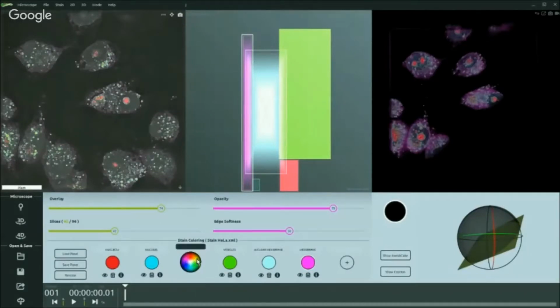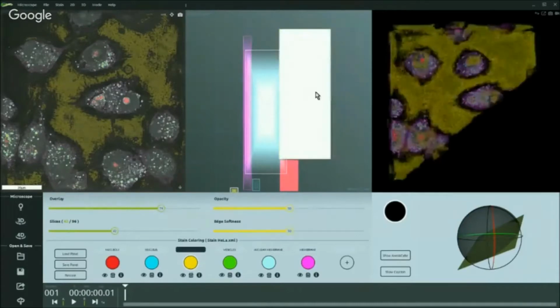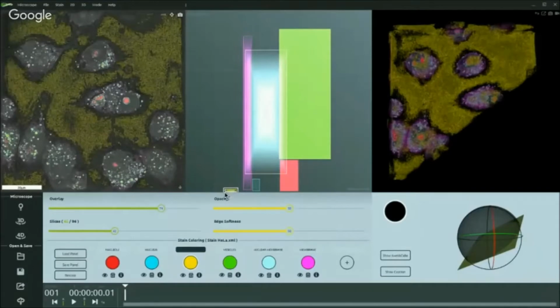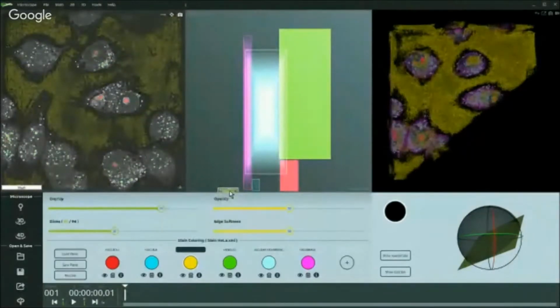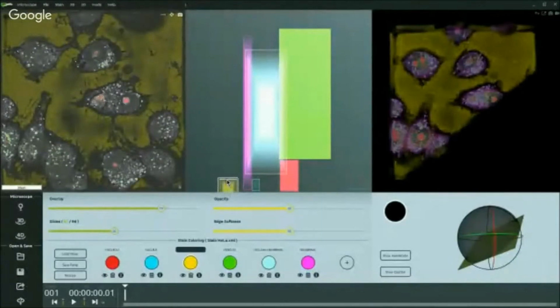You select the color, you select this, you paint your background so that you have a good representation of the background. Then you can go here, increase the background so you're sure you are going to get all you want. Okay.